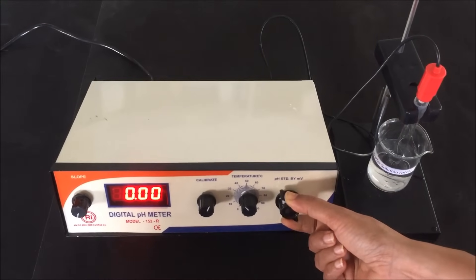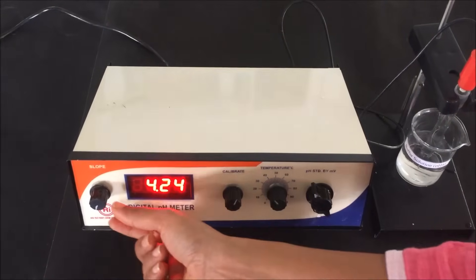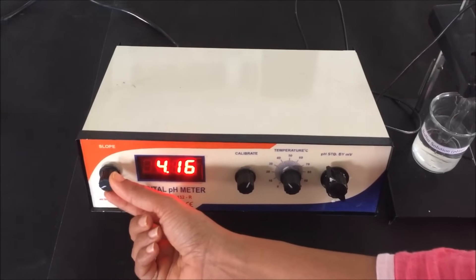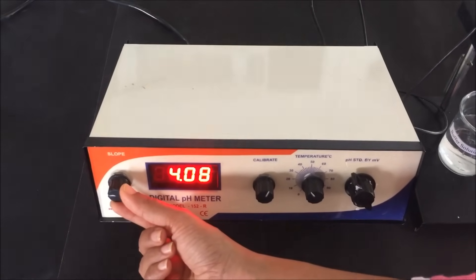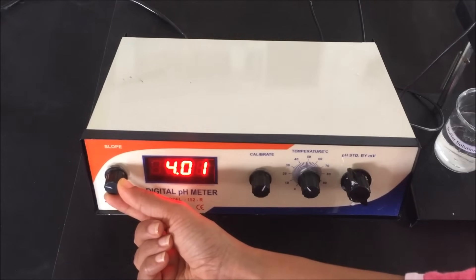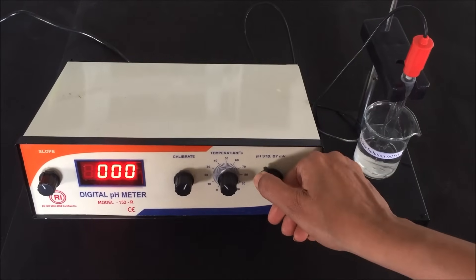Rotate the function knob to pH mode and wait until the display shows a constant reading. At this time, rotate the slope knob until the pH meter display reads pH 4, which is the pH of our buffer solution. The display becomes constant at pH 4 — our pH meter is now calibrated.